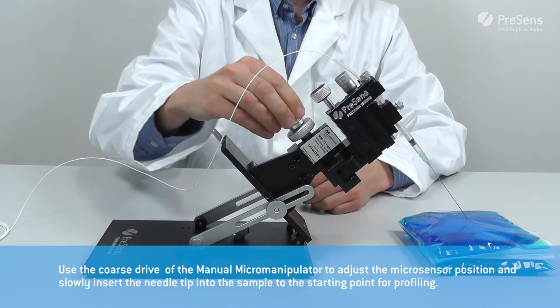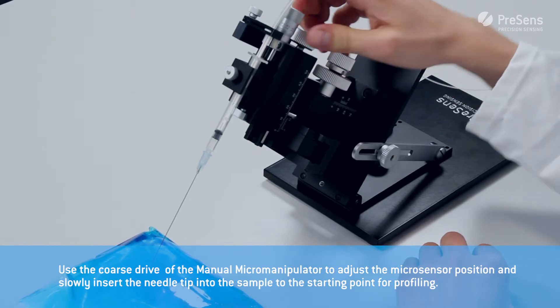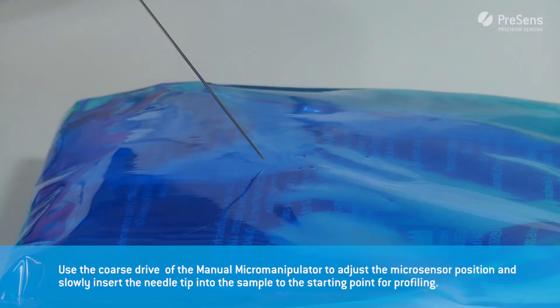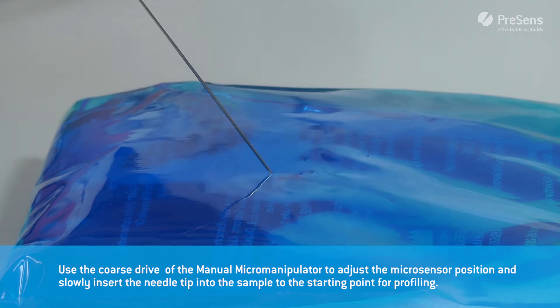Use the coarse drive of the manual micromanipulator to adjust the micro sensor position and slowly insert the needle tip into the sample to the starting point for profiling.